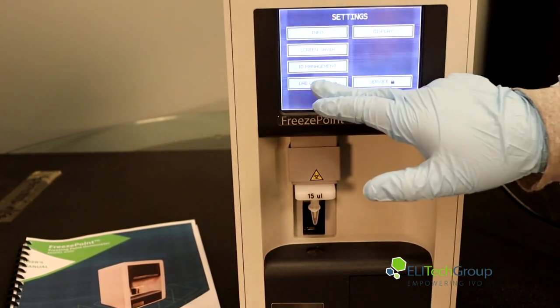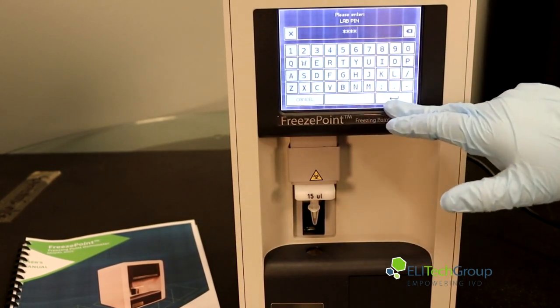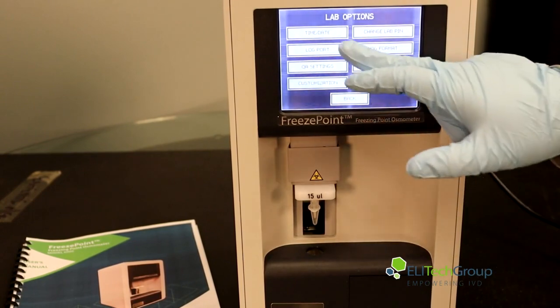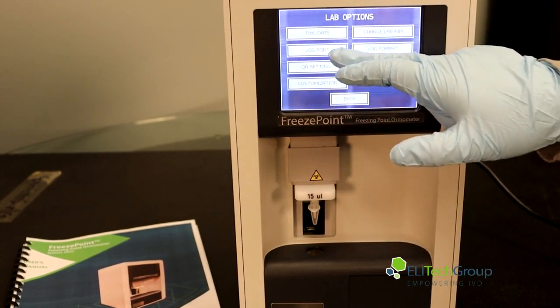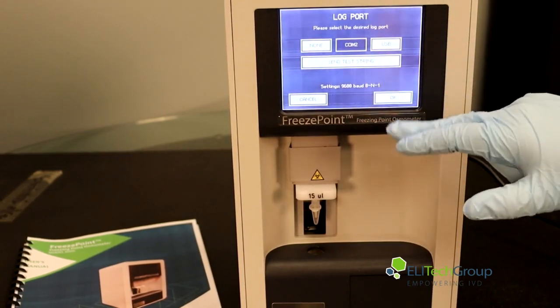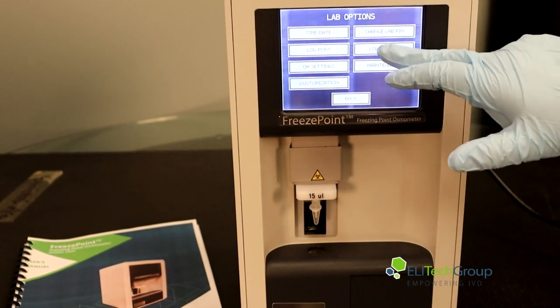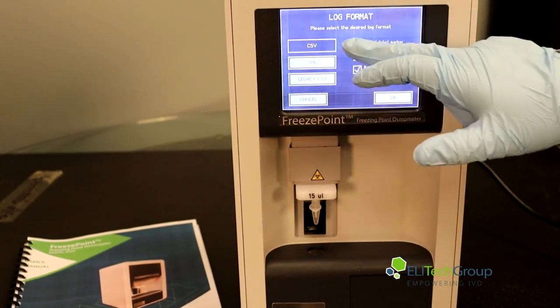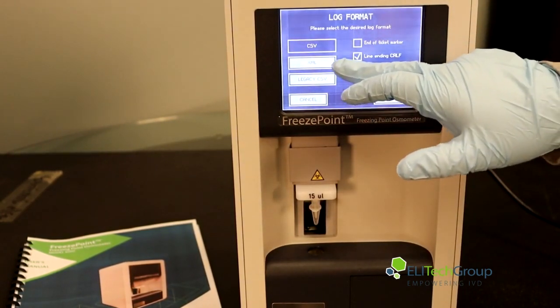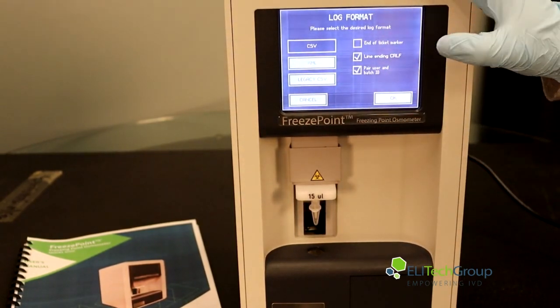You can go into lab options where you can set a lab pin, adjust time and date, and configure your log ports to choose which one the data is coming out of. You can also set a log format — you can do CSV, XML, legacy CSV, or use this software with PuTTY.